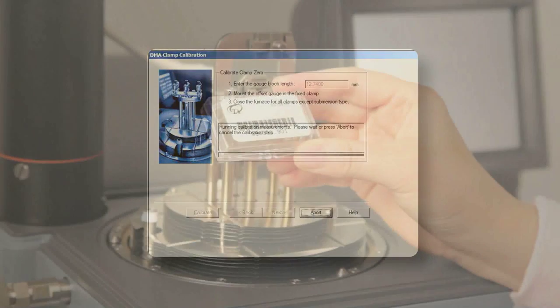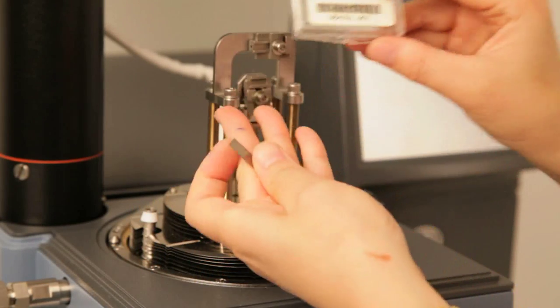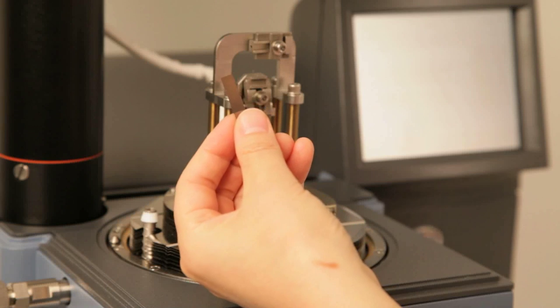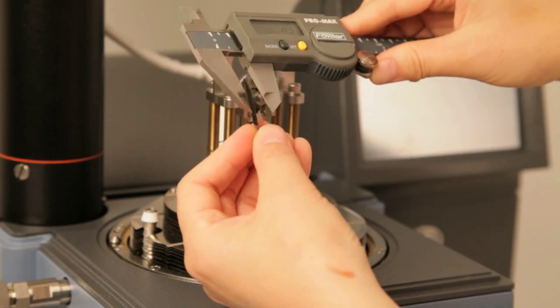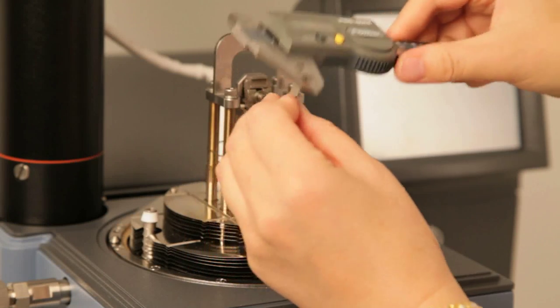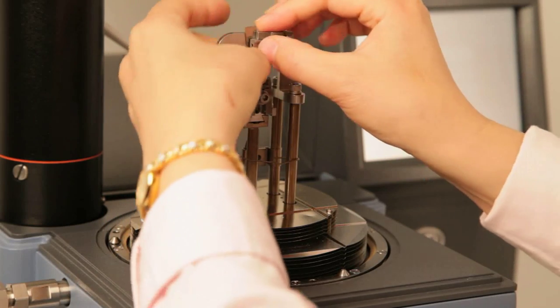For clamp compliance calibration, take the compliance calibration steel shim from the clamp kit. Use the caliper to measure its width and thickness. Then load it to the tension clamp.